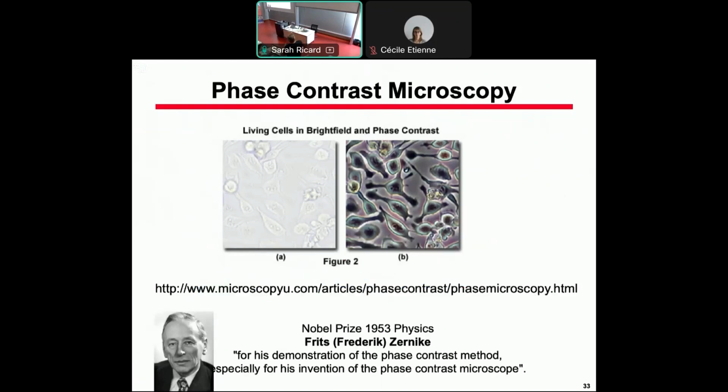And at some places, the phase contrast. He got the Nobel Prize because, in fact, that was the very first microscope able to study living cells with details without markers. For example, the very first movie of chromosome separation was done using this.